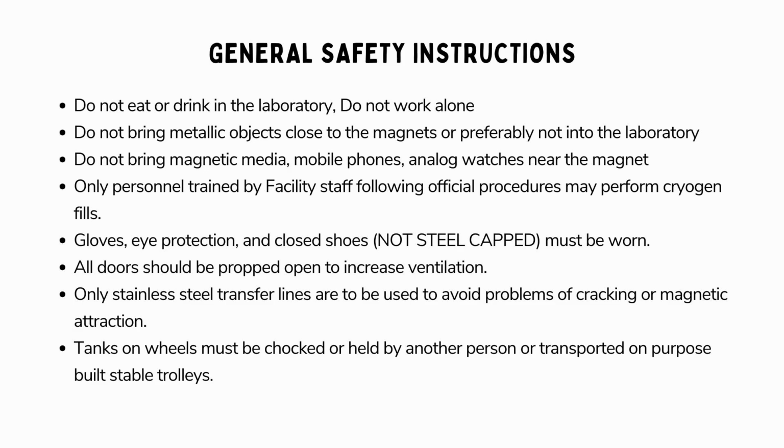Only individuals who have received training from facility staff and follow official procedures may conduct cryogen fills. Safety gear is compulsory. Gloves, eye protection, and closed-toe shoes are required. Steel caps are not permitted. To ensure proper ventilation, keep all doors open. Use only stainless steel transfer lines to prevent cracking or magnetic attraction issues.